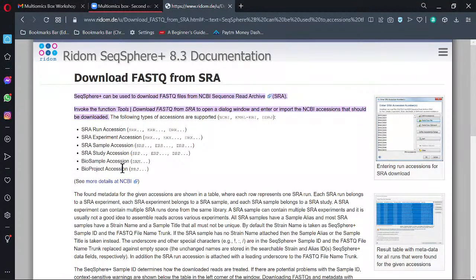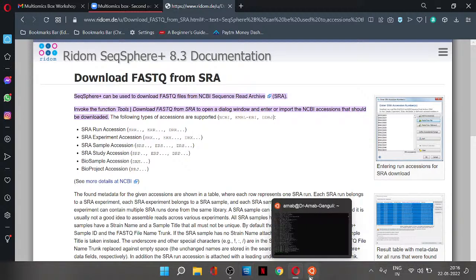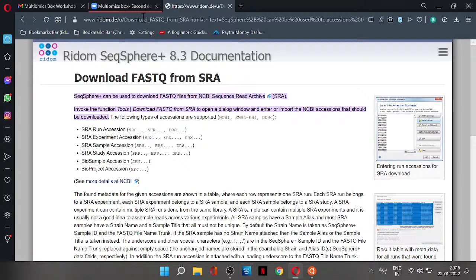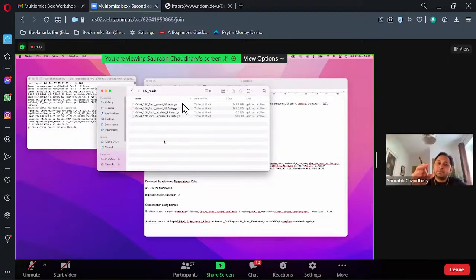If you are using a Unix system, I will tell you tomorrow that you can make an executable file. What the executable file does is you can put all your command lines for individual samples in that executable text file. You save that file, and in the command line, you just run that file. Then the terminal will take each command individually, step by step, and perform the analysis.